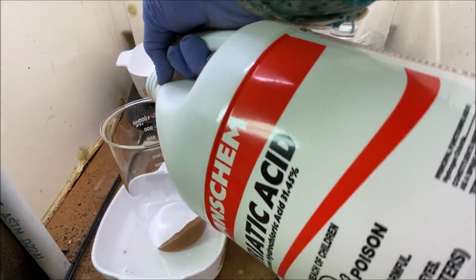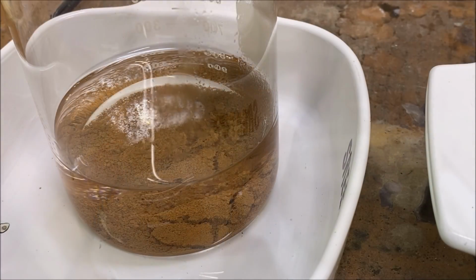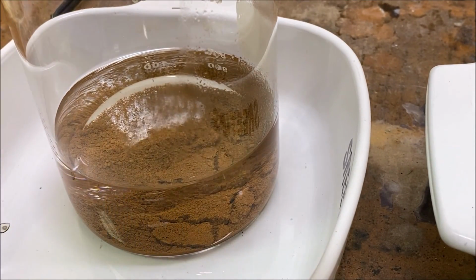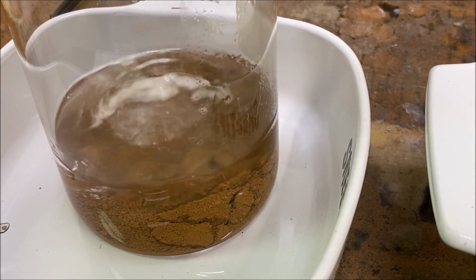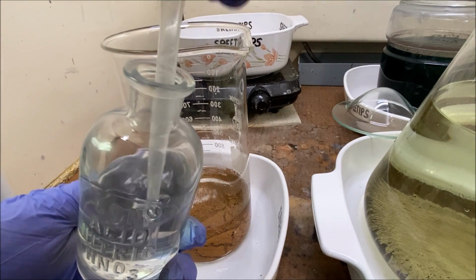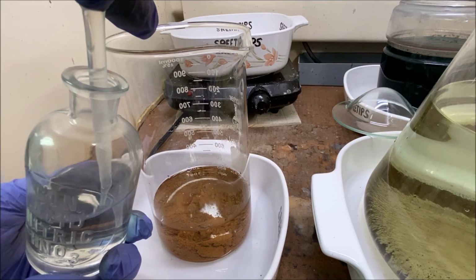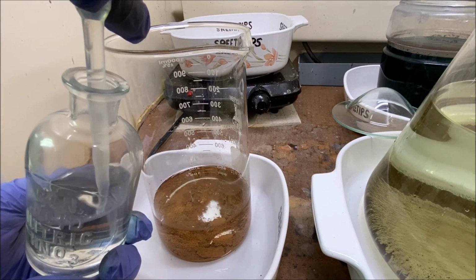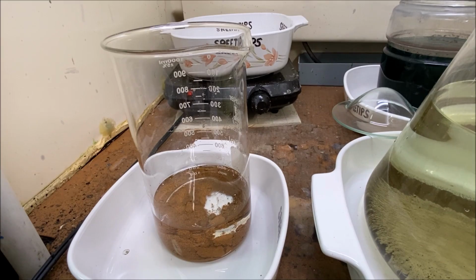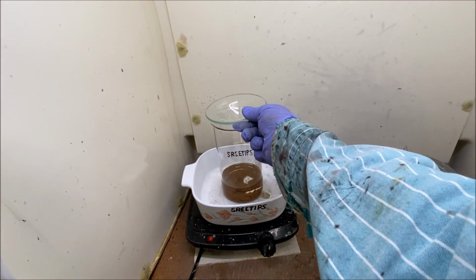Now we're going to dissolve the gold a second time. Add a little sulfuric or hydrochloric acid. I'm going to add some sulfuric acid to precipitate out any lead that may be present. Just a little bit in the pipette here. Now we're going to add some nitric acid and dissolve this gold a second time. I'm adding about four 3 milliliter doses of nitric acid. We'll stick this up on the heat now. Cover it up and dissolve our gold a second time.